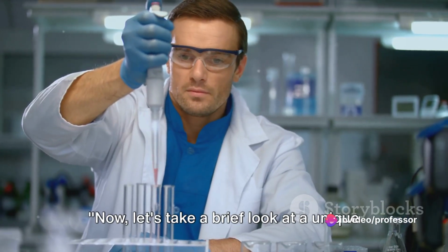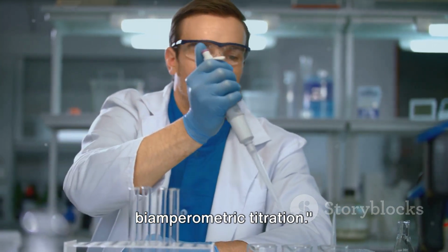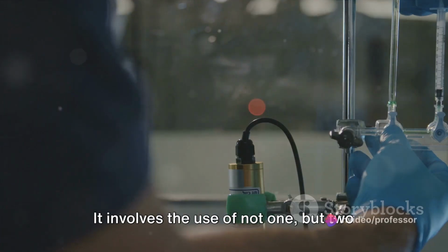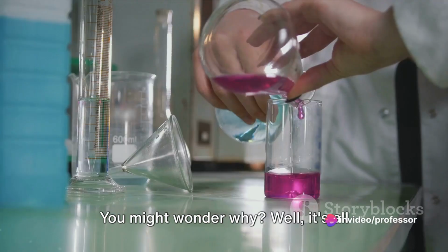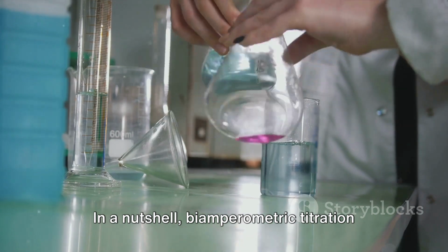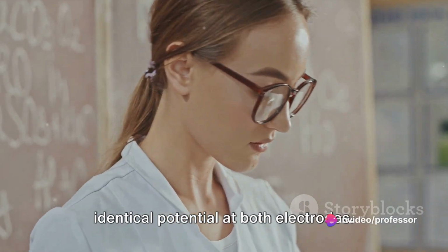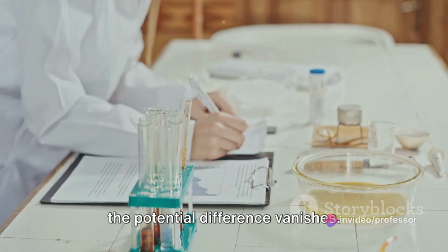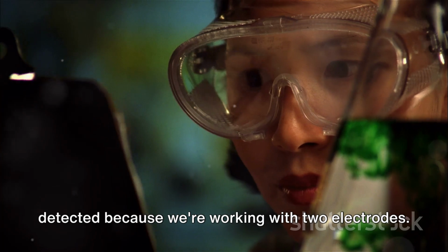Now let's take a brief look at a unique variant of amperometric titration, the Biamperometric Titration. This technique is a bit of a game changer in the world of amperometry. It involves the use of not one but two identical working electrodes. You might wonder why? Well, it's all about improving the precision of endpoint detection. In a nutshell, Biamperometric titration works on the principle of maintaining an identical potential at both electrodes. When the titration reaches its endpoint, the potential difference vanishes. This disappearance can be accurately detected because we're working with two electrodes.